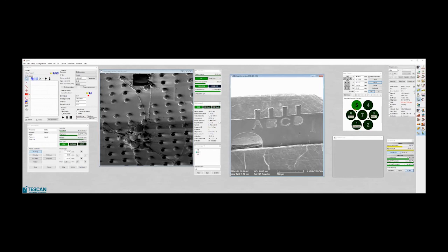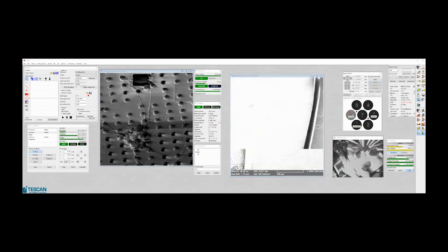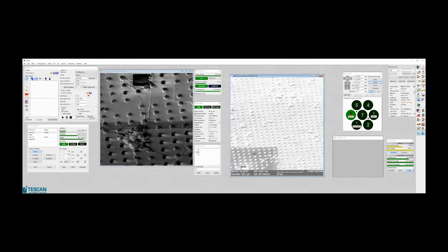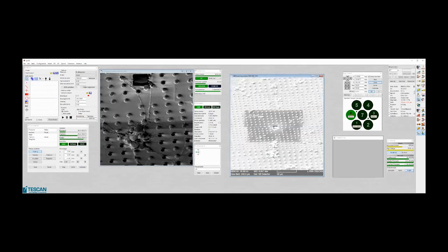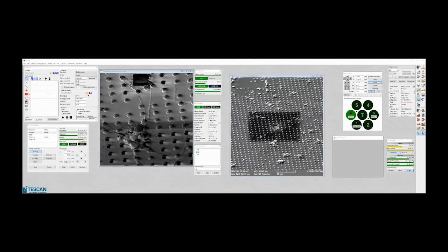So what next? Maybe the tomography could be. So if you don't want to make a whole lamella, if you don't have the possibility for a TEM session, and still you would like to see how your sample looks like, you can do tomography.